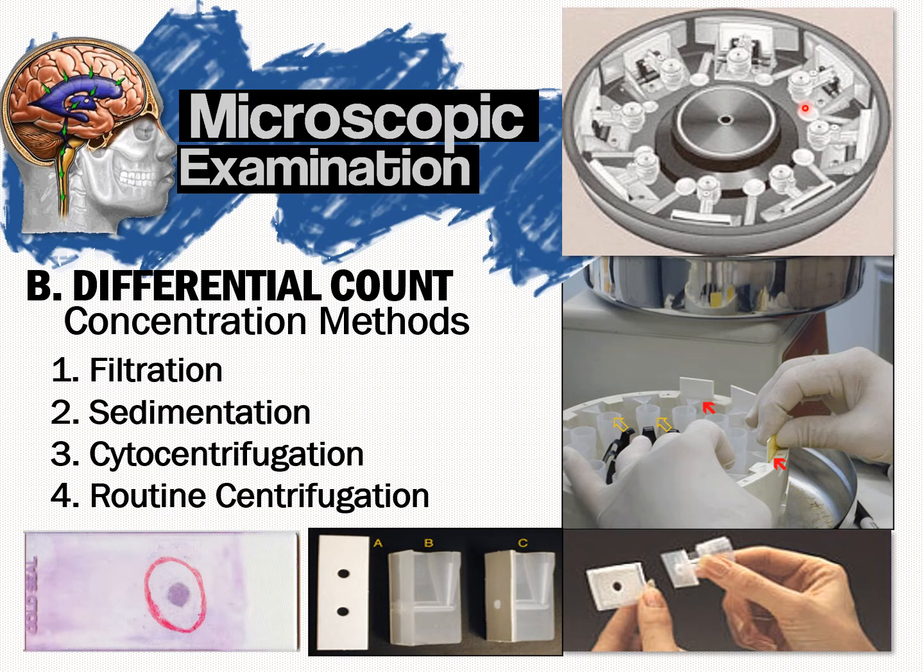And then we have routine centrifugation, the routine one that you see in our laboratory. You centrifuge a sample for 5 to 10 minutes. The supernatant is saved for other tests, and the slides are air dried.